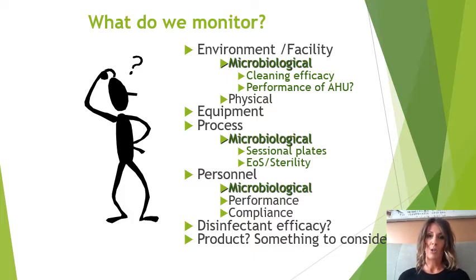Therefore, we can do a couple of different ways of doing it. We have end of session broth fills or sterility testing. So what they do is you build a process that mimics how you would produce an aseptically prepared product. You would substitute the live product for something such as nutrient broth, and you would manipulate that broth, and that broth promotes the growth of microorganisms if there are any present, and will help provide assurance that our technique and our process of producing prepared products is of low risk of microbial contamination.